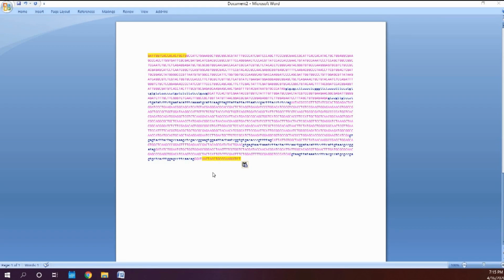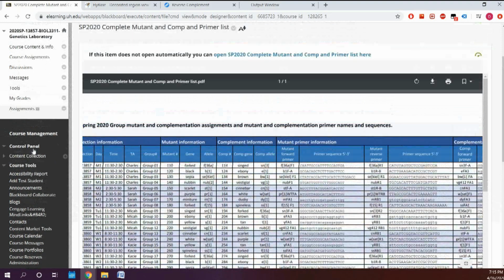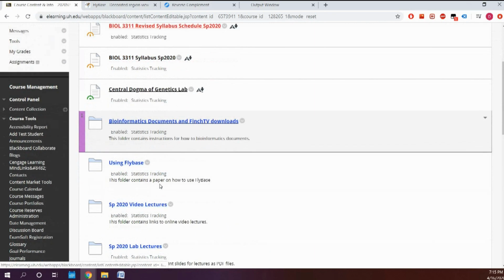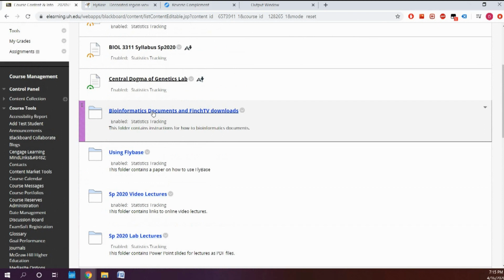Okay, so the second thing we'll go over is the Finch TV stuff. So first thing you want to do is, I'll show you guys where it is. I'm going to go to Blackboard. You want to go to course info. Then you want to go to Bioinformatics documents and Finch TV downloads.